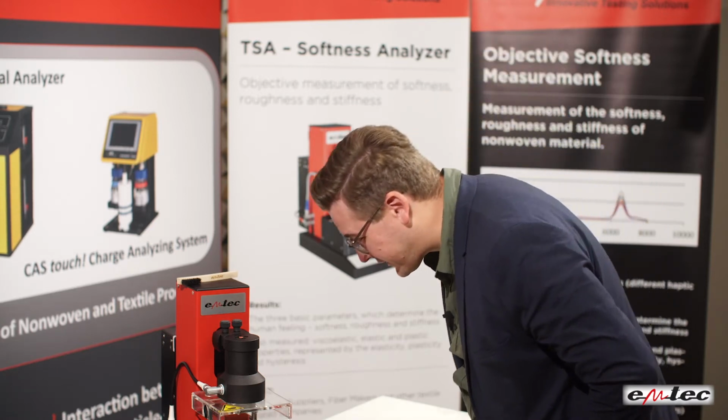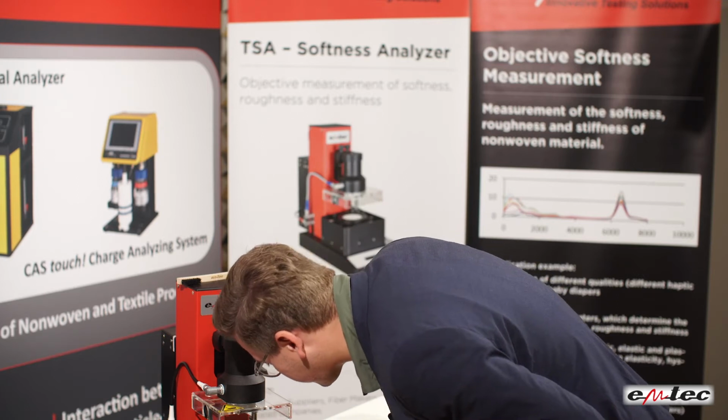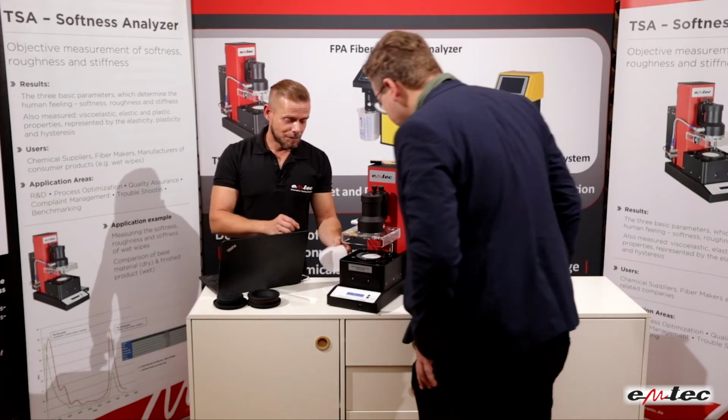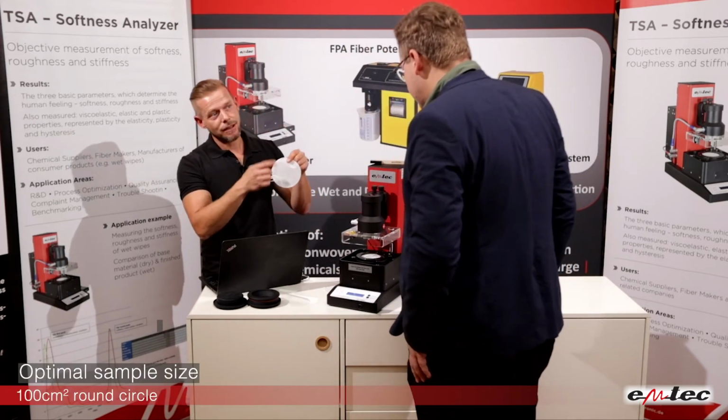And do I have to take care about sample size or something? Is there any requirement? Yes, the recommended sample size should be 100 square centimeters as a round circle.